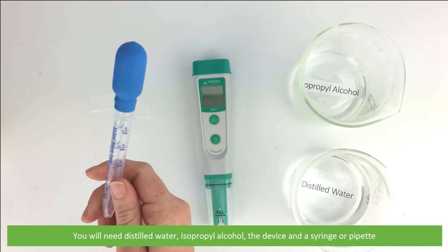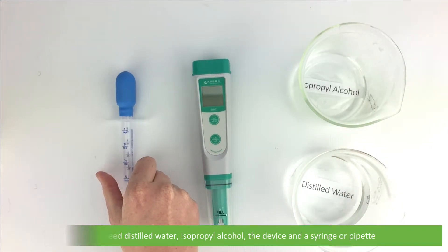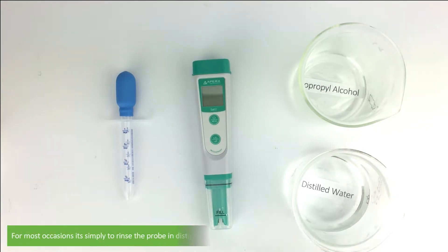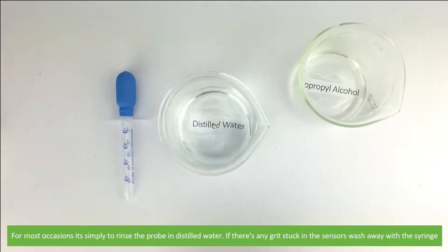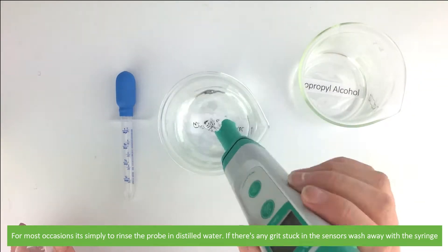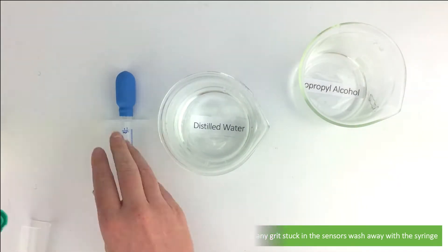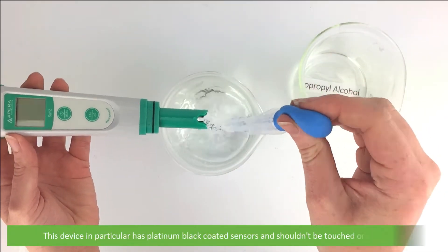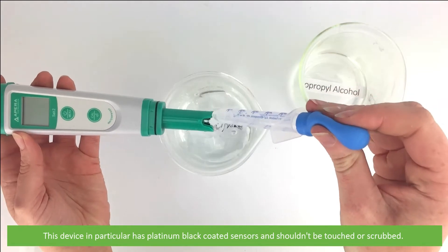For most occasions you can simply rinse the probe in distilled water. If there is any grit stuck in the sensors, wash it away with the syringe. This device in particular has platinum black coated sensors.